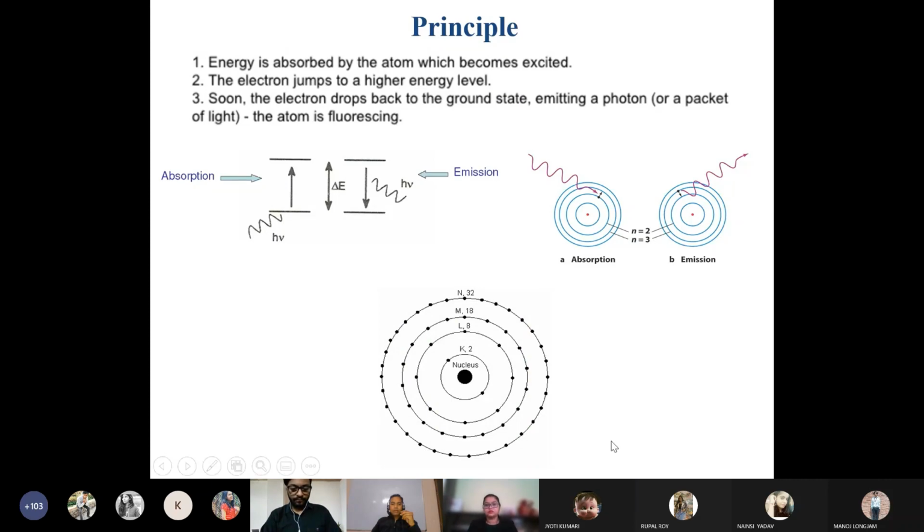The electron at its resting state, when hit by light energy, or small wavelength electromagnetic radiation, gets excited and moves to a higher energy state, but it is not able to stay there for a longer period of time, and it comes back to its resting state.